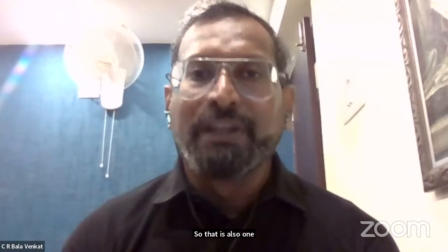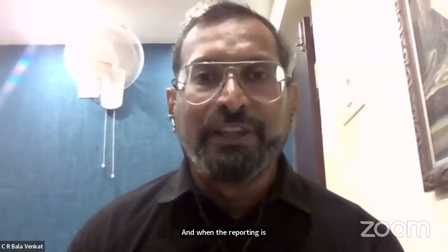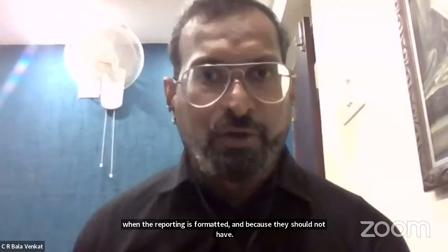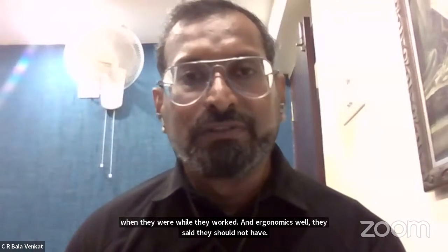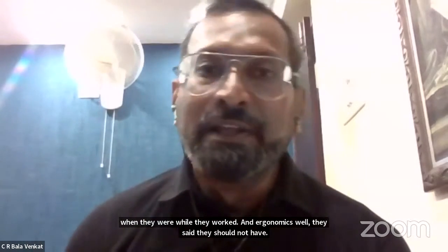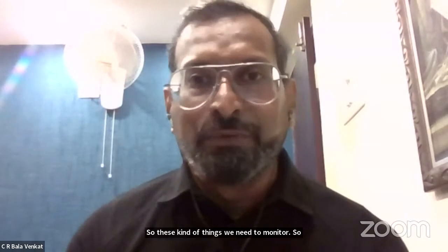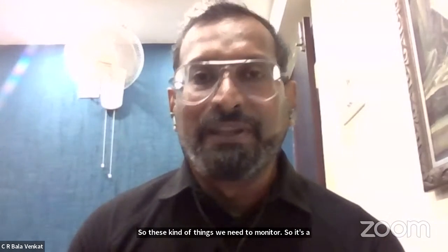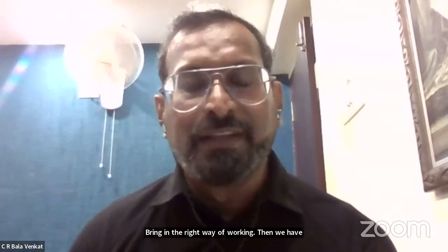And when the reporting is formatted, they should not have confusion while they work, and with the ergonomics, they should not have tiredness or any kind of discomfort. So these kind of things we need to monitor. So it's a big process which we have to set, and then we have to bring in the right way of working. Then we have to make them practice it.